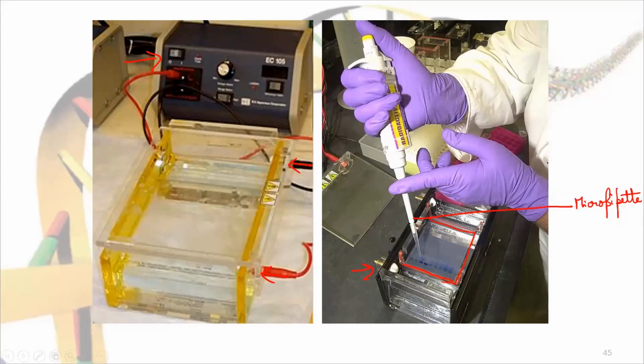When you put the DNA here, you can see a slight blue color here. Actually, how this happens is, DNA does not have any color, so along with the DNA mixture, they add a loading dye. We call it a loading dye because it helps us to visualize whether the DNA is successfully loaded at a designated well.